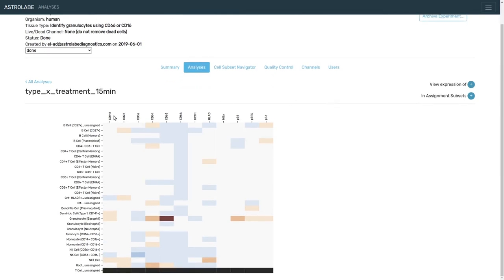And you'll notice that this heat map is much more populated, it has many more colors, because now we will also identify differences between the controls and the patients as individuals, which might not be relevant for the analysis that we are doing here. We're not interested in heterogeneity within the population. What we care about is heterogeneity in response to stimulation.